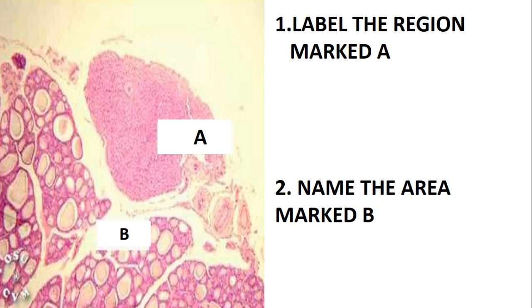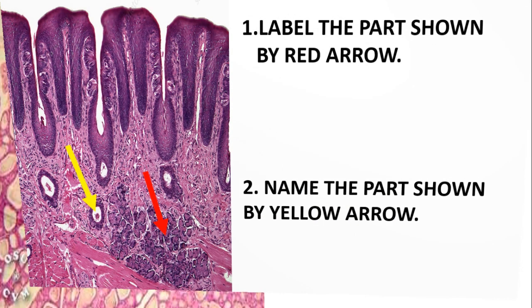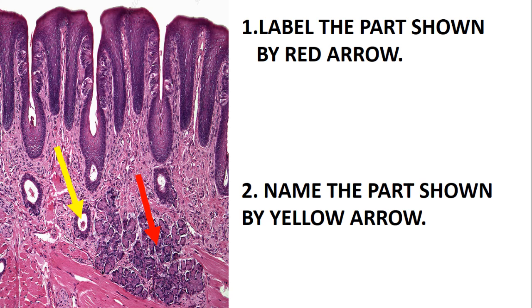The next slide asks you to label the region marked A. This slide has two regions: one region here and another region there. The other region has some follicles, but this other side does not. So A is simply the parathyroid gland, and B is just the thyroid. The parathyroid is an island of gland which does not have follicles. We'll look at these two glands in detail.